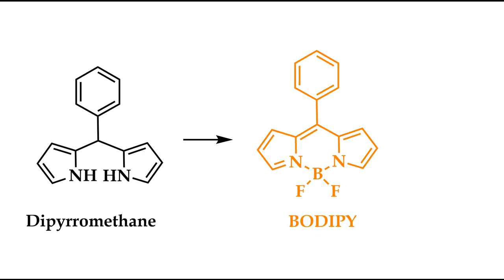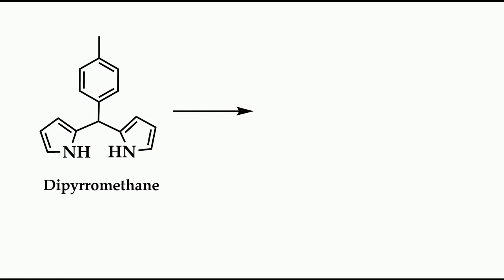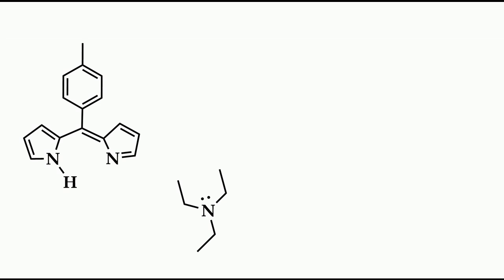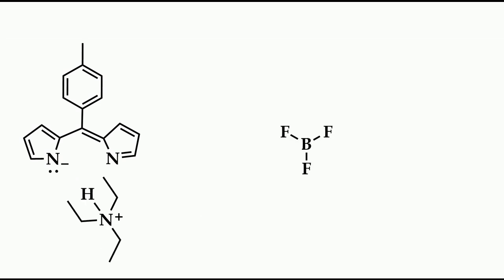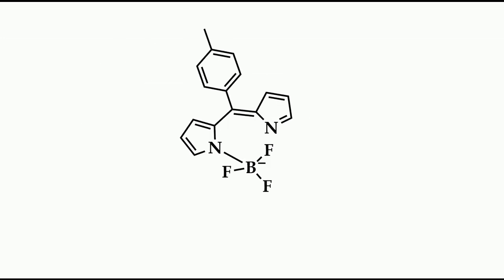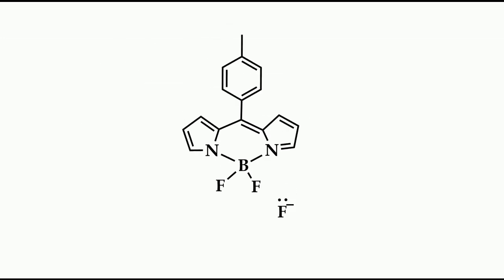In the next step, I converted dipyrromethane into the BODIPY core. To do this, I first oxidized with DDQ. Then I added triethylamine to remove the proton from the pyrrole ring. In the final step, I added boron trifluoride, which leads to the BODIPY structure.